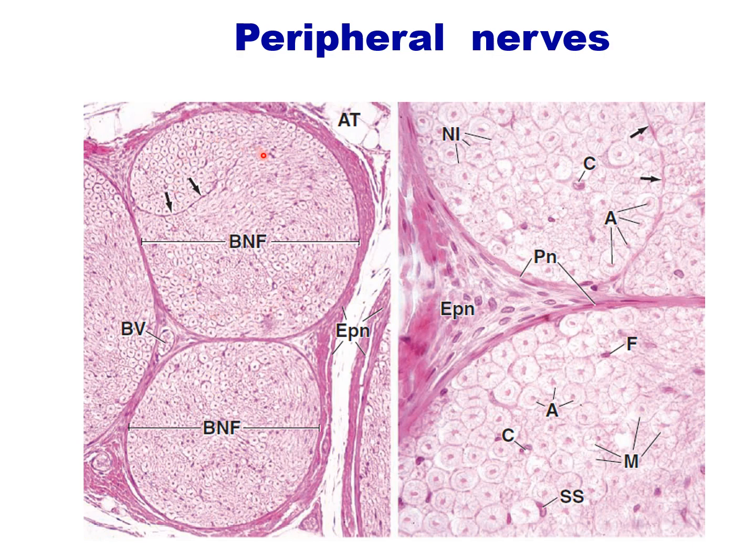The hematoxylin and eosin do not stain the myelin, that's why it looks white. This is the group of nerve fibers, bundle of nerve fibers, and inside this is the axon. Individual axons can be seen, and endoneurium is the connective tissue which has taken the eosin stain.